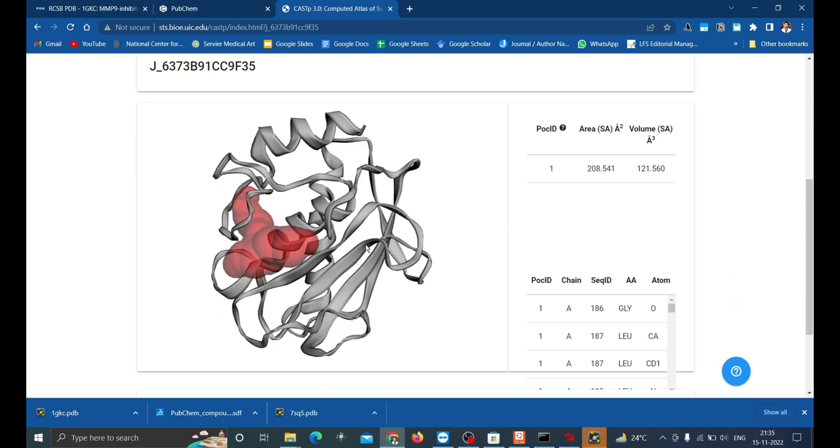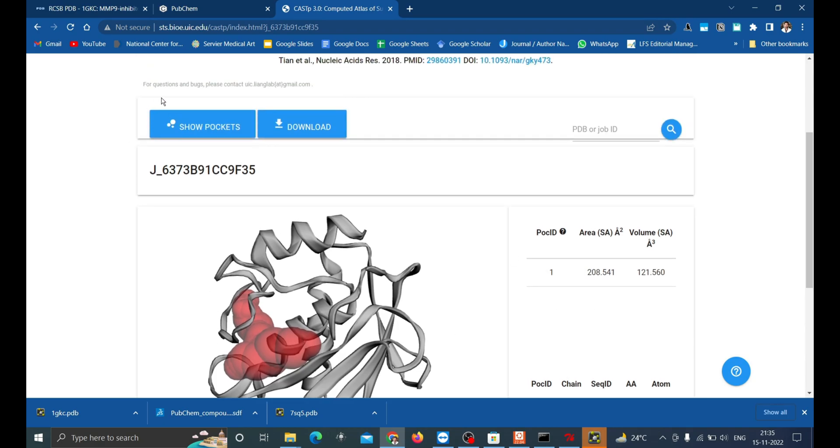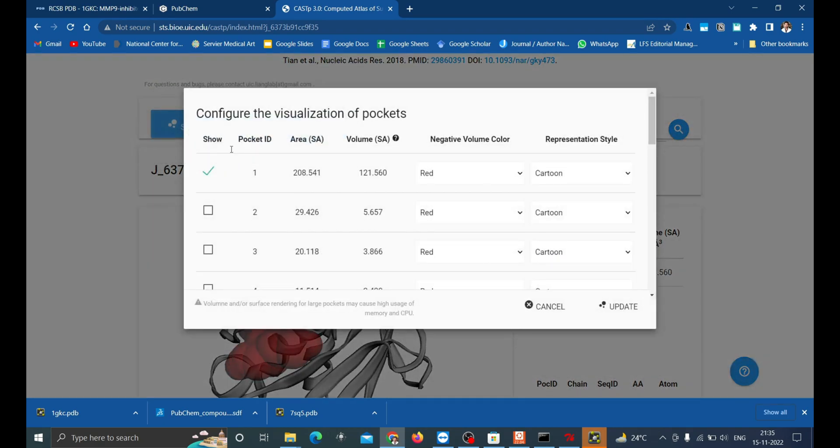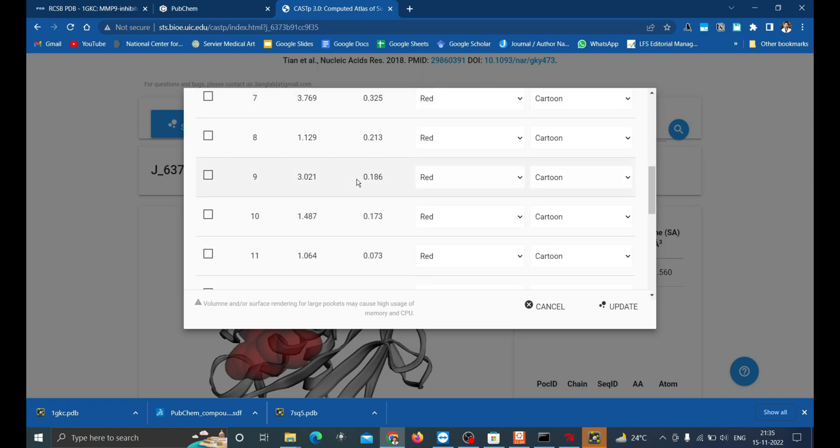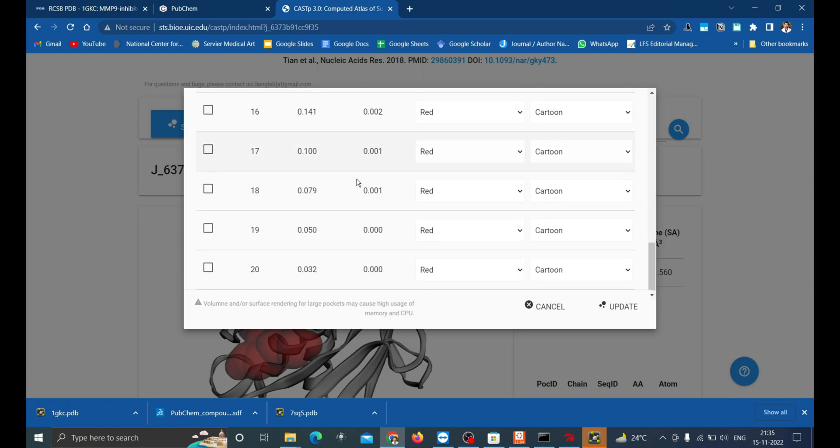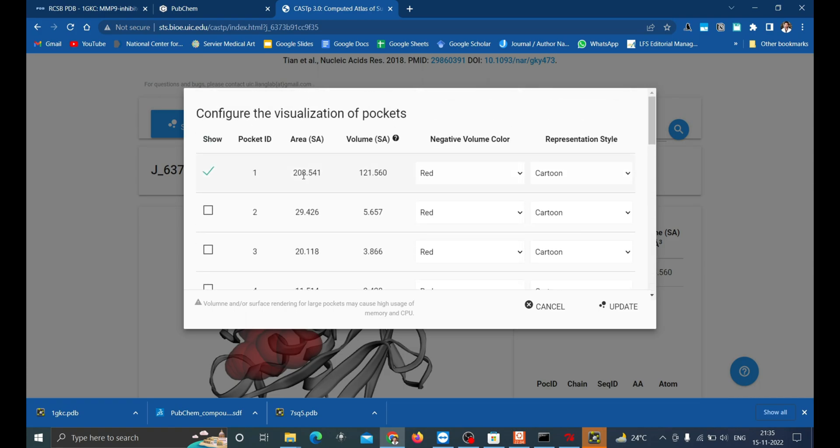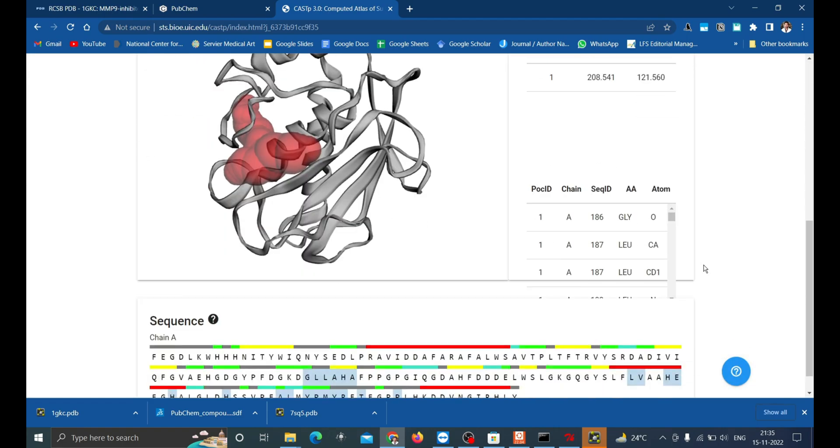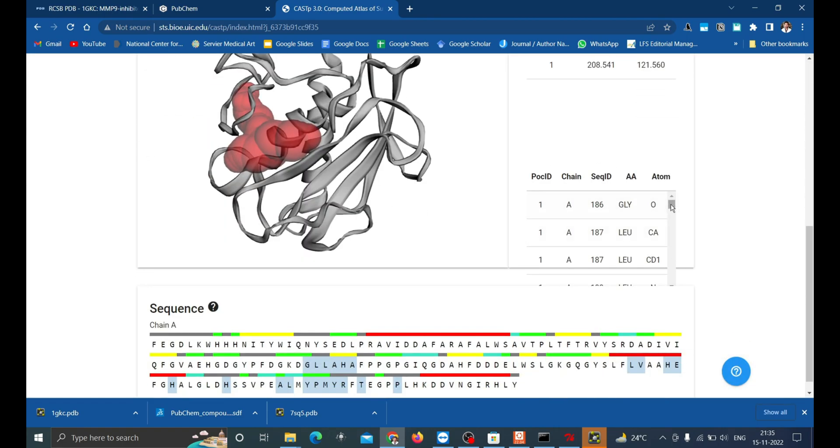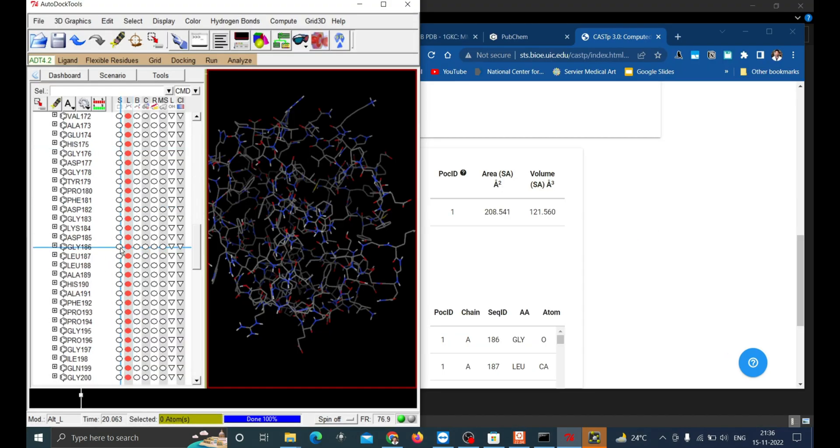The active sites is in the binding pockets where the catalysis occurs. You can click on the Show Pockets to see many more binding pockets. Around 20 results are given for this. We'll just go with the pocket with higher area and volume. Now each of these amino acids are marked in the macromolecules in AutoDock which is highlighted in the visualization area.